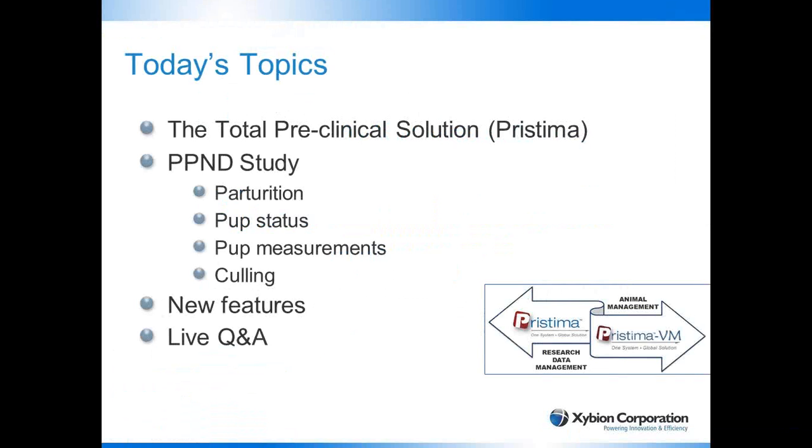A quick introduction as to the topics that are going to be covered in today's session. There's going to be a brief overview of who Pristima is relative to the total preclinical solution. And then as we transition over to our speaker today, Tom Klapmutz, he's going to take us through a PPND study that's going to include some focus on the following topics: the pup status, pup measurements, culling, etc. This live demonstration portion should last approximately 30 minutes or so.